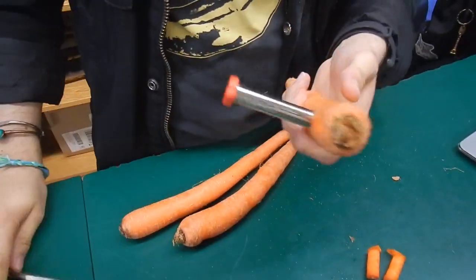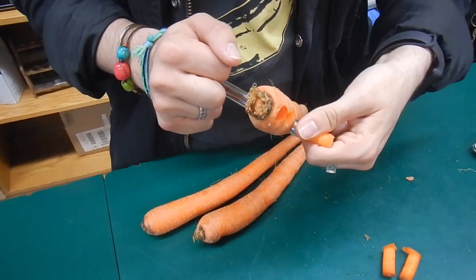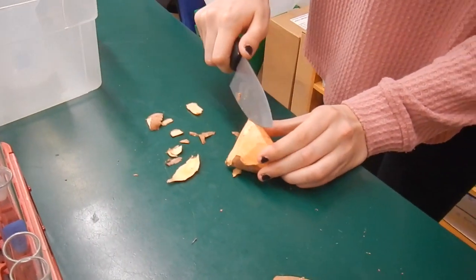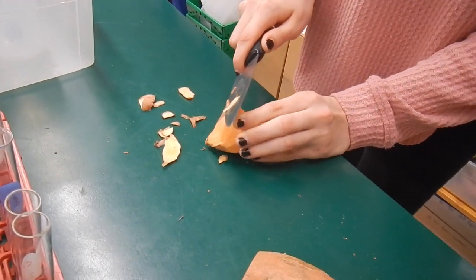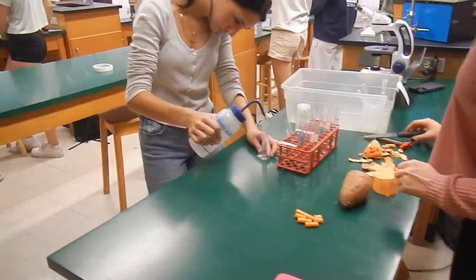Guess you have to cut 15 pieces. You have to cut 15. Yeah. Okay. It doesn't matter, the size doesn't matter, right? No, I don't know. We want the water is like these. Yeah.